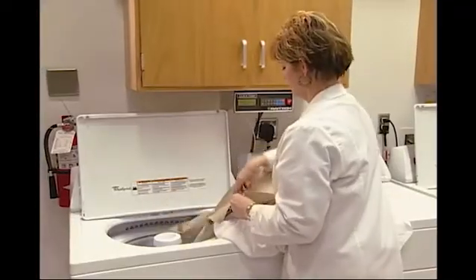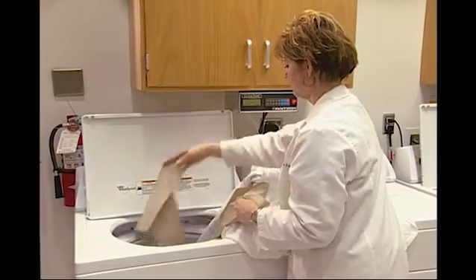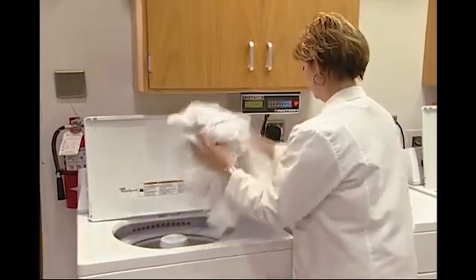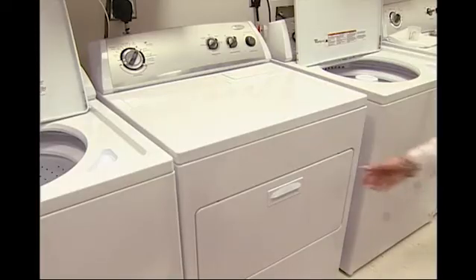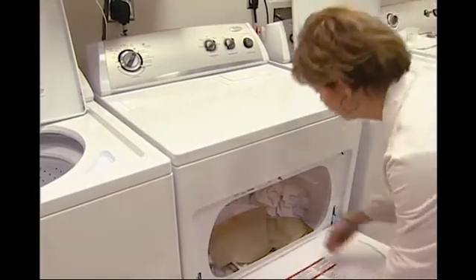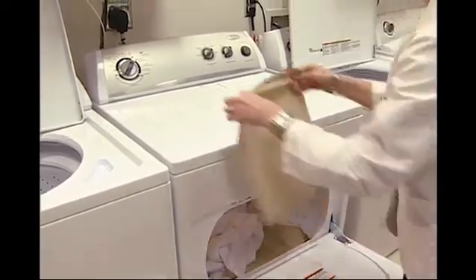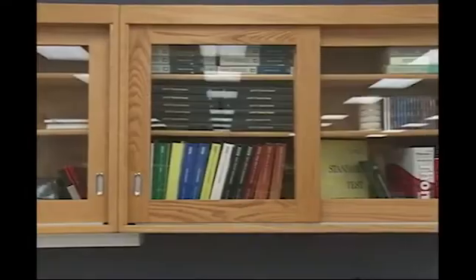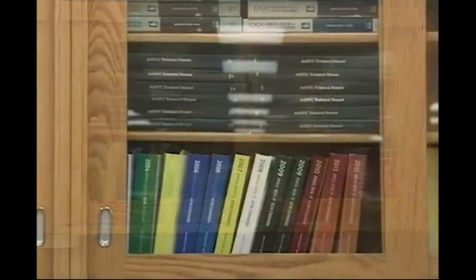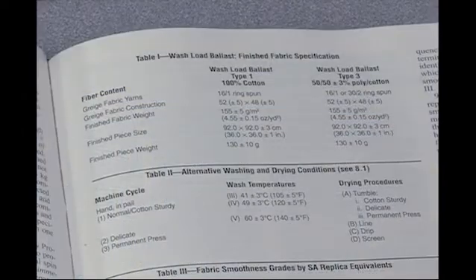Title 16 CFR Part 1610 requires that fabric must be tested as-is as well as after it has been refurbished. According to this regulation, refurbishment means that all fabrics must be dry cleaned followed by one home laundering. The dry cleaning procedure is a commercial dry cleaning cycle, while the home laundering procedure entails specific options for washing and drying cited in AATCC Test Method 124.